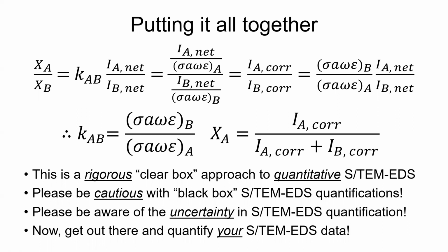Of course, right, we showed that there's some uncertainty in these measurements, okay? I don't think something on the order of 10% is unreasonable when you're talking about a standardless analysis like we were doing here, where we calculated the sensitivity factors from first principles, okay? The other thing, too, of course, is that we neglected absorption in this, right? Because it's difficult to model, but that is something you would also need to possibly take with a grain of salt, okay?